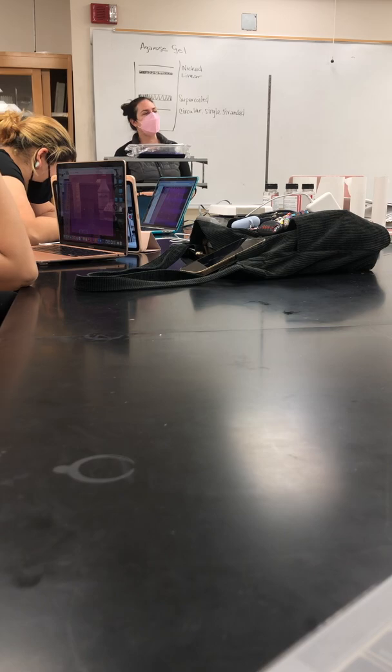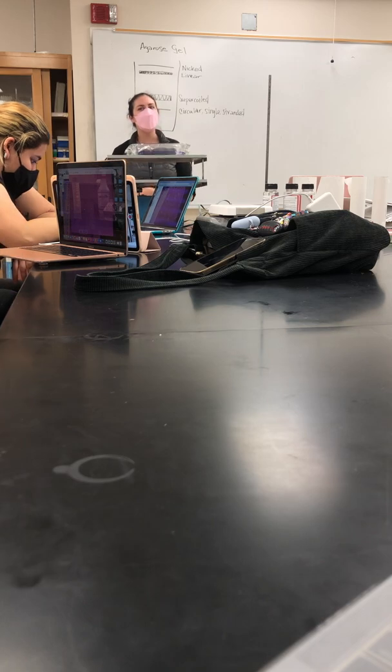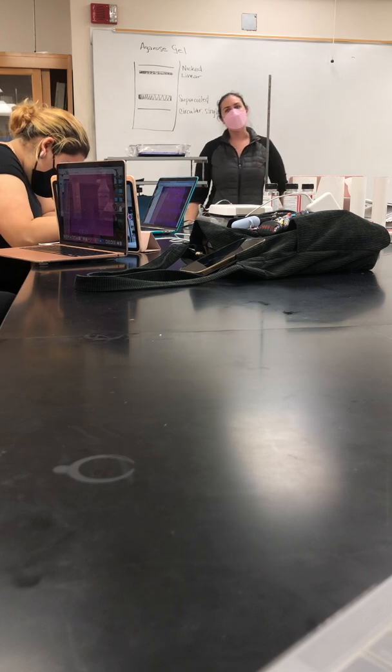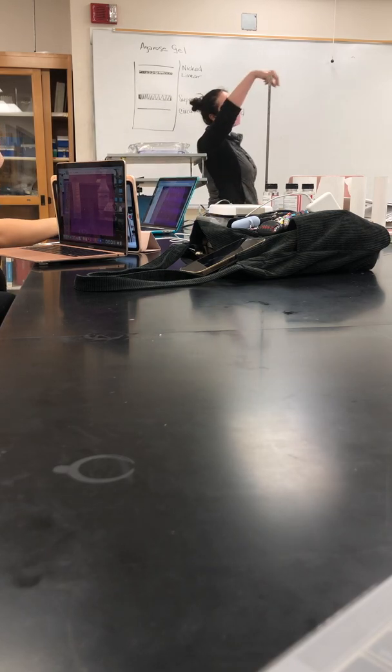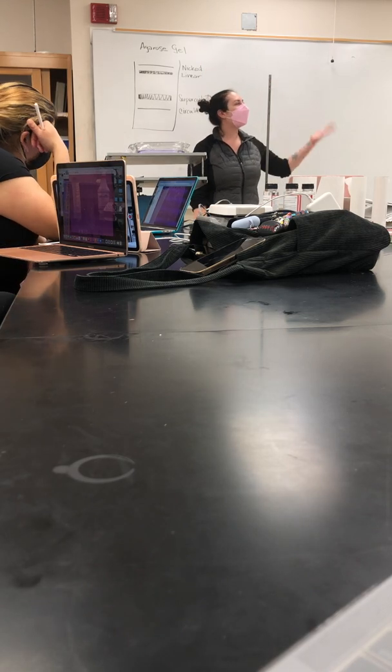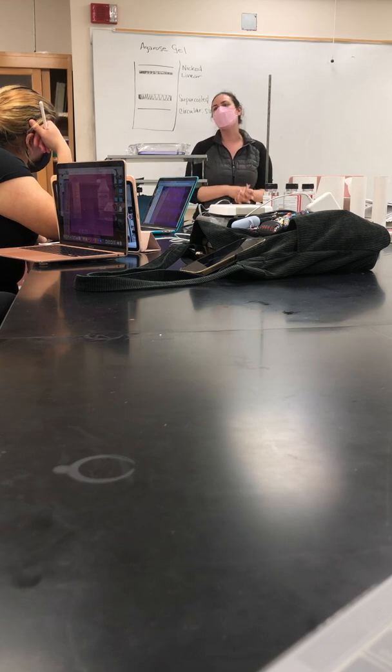Great job. So it's really important to know the differences between the different types of gels and why you use them, okay? Because when you work in industry, they're going to tell you, okay, run it on the gel. How many different gels have you guys worked with in this course? 3 technically, right? We had the SDS type, where it had stacking, and then we had the type where we didn't have the 2 layers for our acrylamide, and then we have our agarose gel. Agarose gel we actually use more after we run a PCR sample. With agarose gels we're also able to slice out our DNA, our proteins, our vectors, and we melt the gels, and we're able to grab the proteins or the DNA out of them, and we're able to actually get a pure amount of those samples, okay?